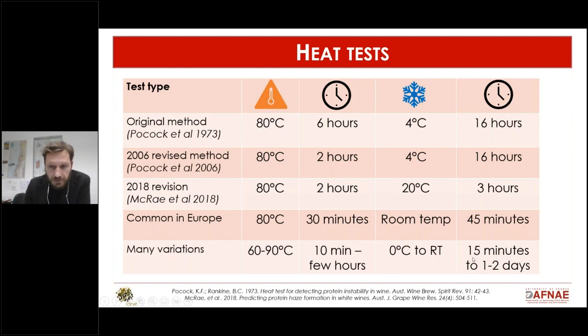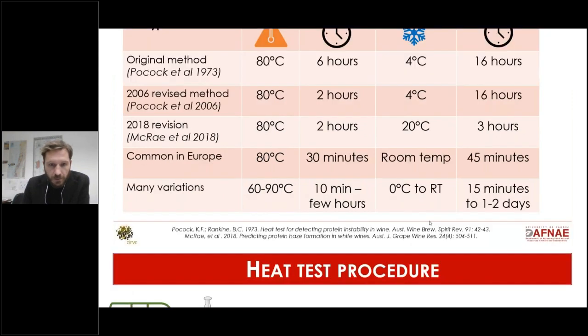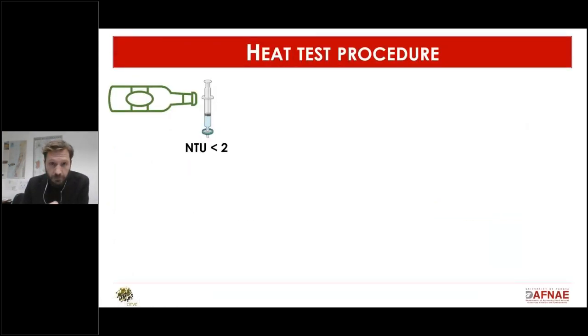And for some cases it's very short, 15 minutes, some cases it's quite long, up to 1 or 2 days. So there's a lot of variation on the theme of the heat test. So how do you do a heat test? For those of you that are not so practical with this procedure, I'll try to summarize it with some infographic.